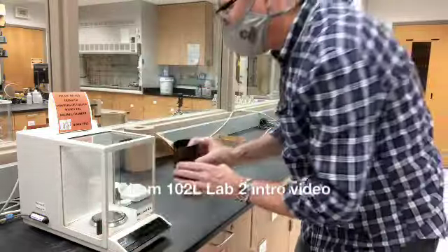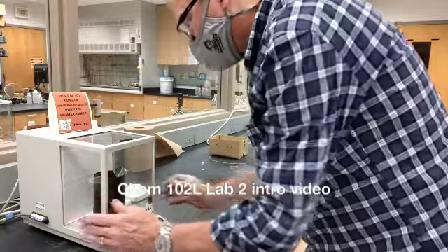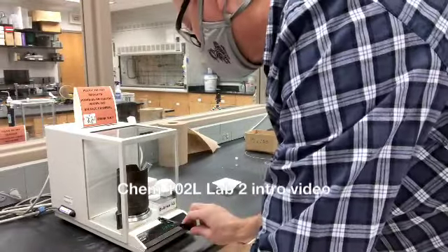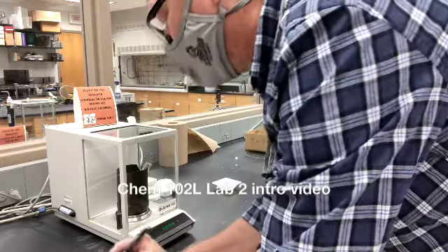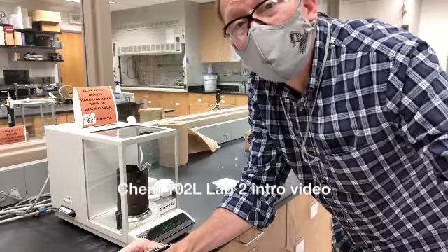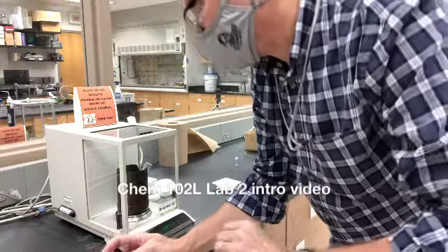I'm going to weigh that whole business. And now I can read off of my balance a new mass. And that says 0.8408. Now it was less than a gram, so I only have 4 significant figures, but it's measured all the way out to the nearest tenth of a milligram. And so I know that mass really pretty accurately.